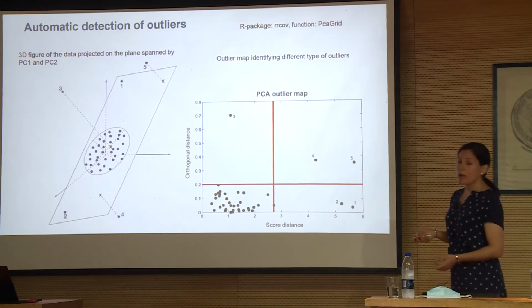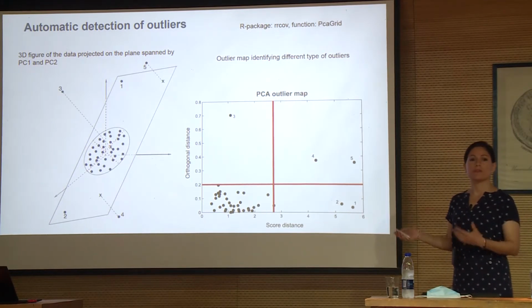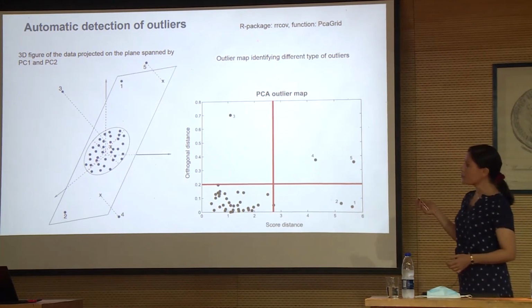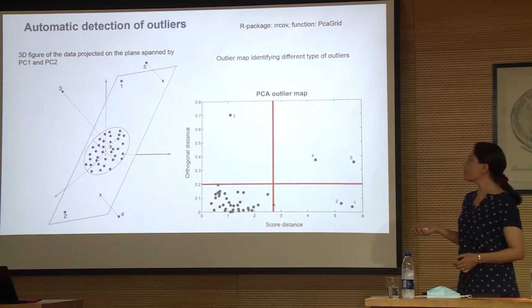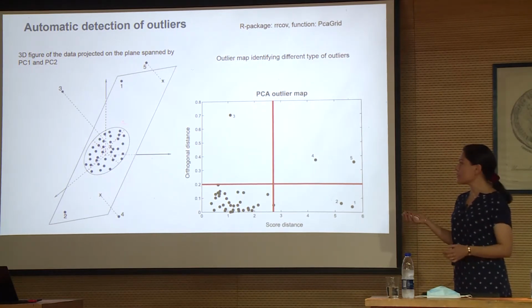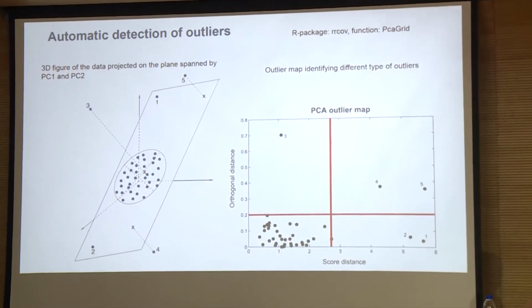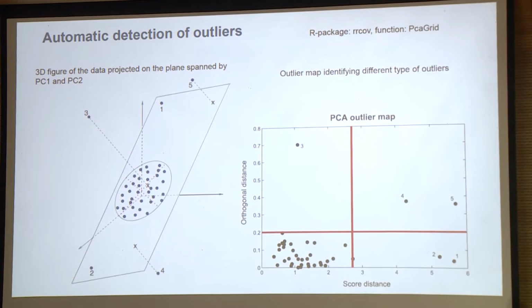I don't know R, I cannot use it. That's why, to develop the workflow, a bioinformatician, she was the one who developed everything. And for this, we use a package that you can see there. Maybe if you're familiar with it, you will know what I'm talking about. So here we have PCA, and the plot is in 3 dimensions here. And this is what you see in 2 dimensions. This is the classic principal component analysis that you all know.